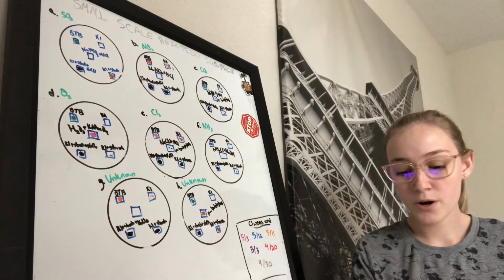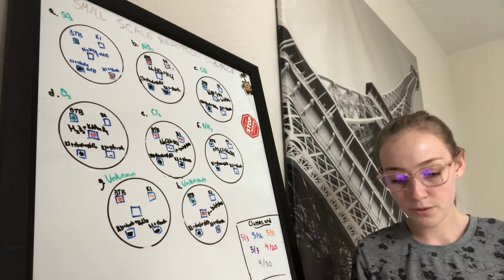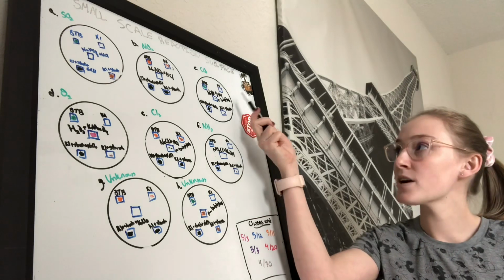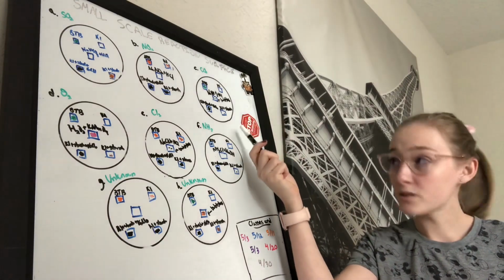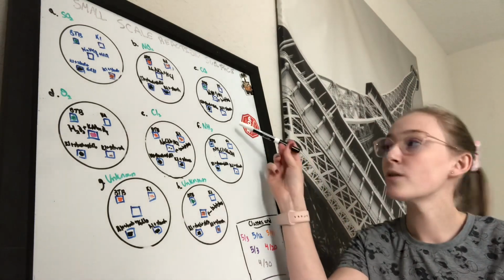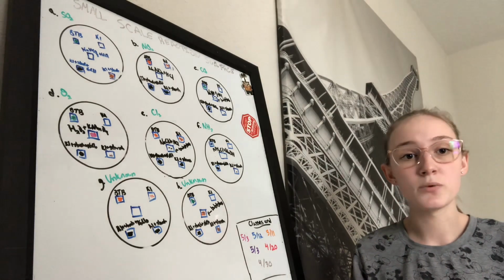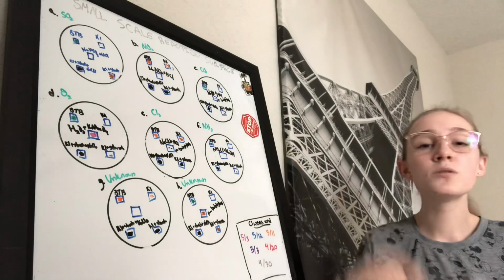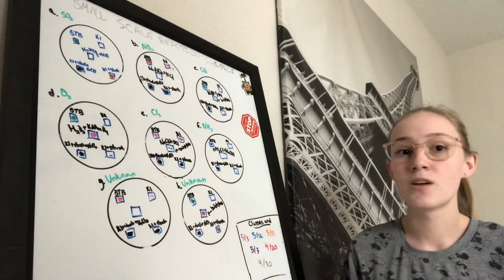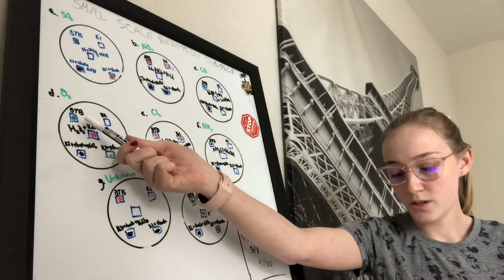So with the third one, which is reaction C, you have NaHCO3 plus HCl, and the BTB stayed the same, the KI stayed the same. The KI plus starch turned into a sandy color with a little bit of brown, and I just did a dot of brown in there to illustrate that. And then the KI plus starch plus NaClO stayed the same. It was still that black color. And then you have bubbles in there, which helps you come to the conclusion that CO2 was the identity of that gas.